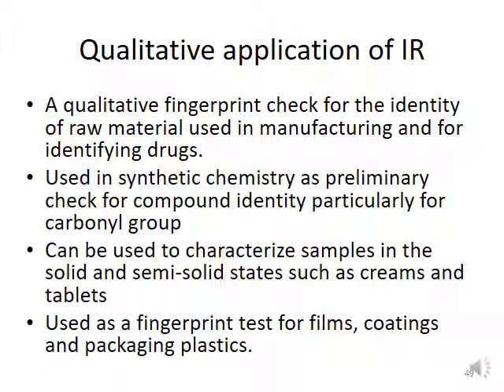Okay, and next is synthetic chemistry. Basically, they will try to identify the compound in which the chemical reaction occurs, and what the chemical compound is that they investigate. So this is more towards organic chemistry.